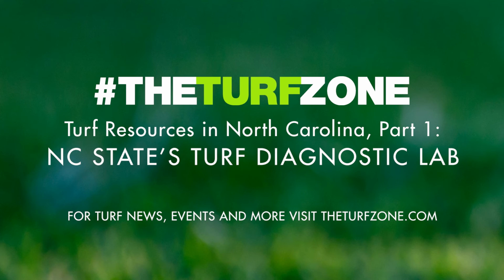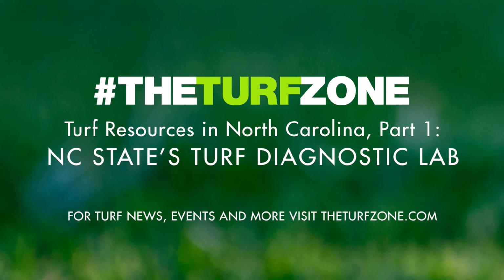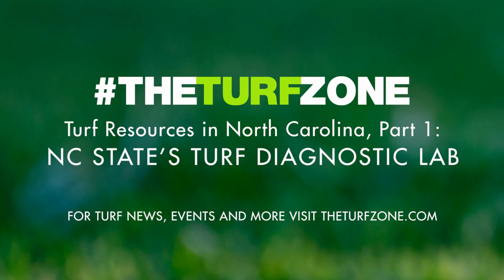A video guide is available on our website for proper sample collection. However, be sure you collect your samples along the margin of damage. Ideal samples are 50% damaged and 50% healthy and no deeper than the root system. Shake off excess soil to reduce shipping costs.